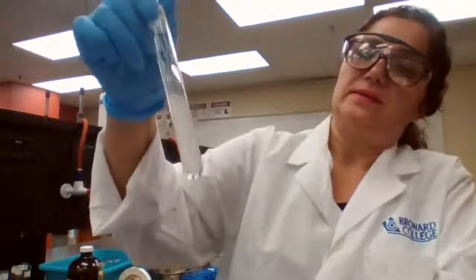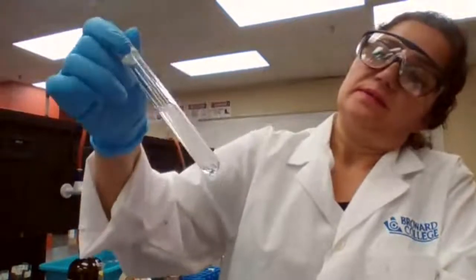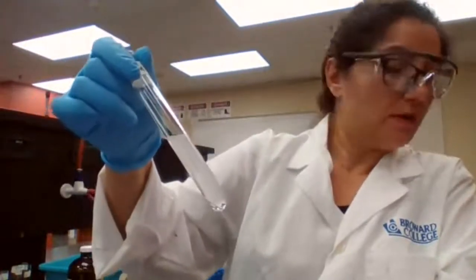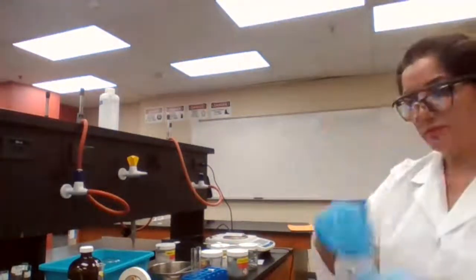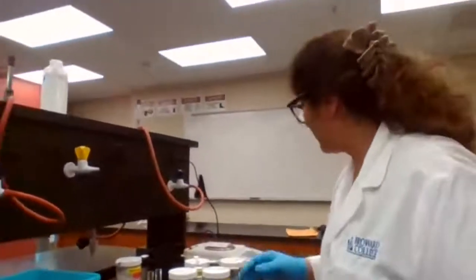Go get the, I can start part C of the experiment, because part C is not asking us to record the time. It's just saying to observe the reaction for the two. Okay. So I'm going to leave this 0.2 going, and I'm going to start the experiment for part C, because I don't have to put any numbers.